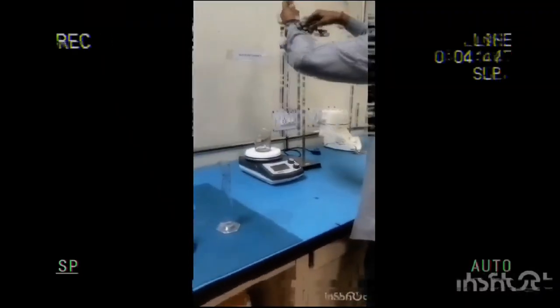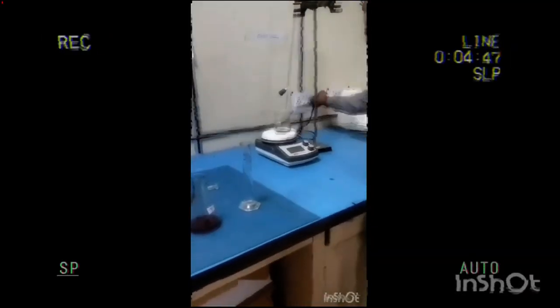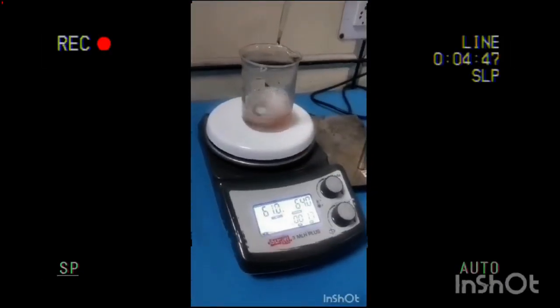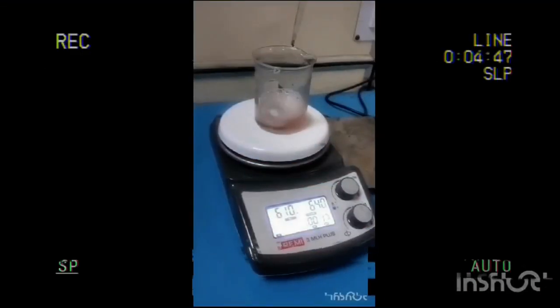20 ml extract is taken to check pH. It is maintained at 5 by adding acetic acid or NaOH. 10 ml extract of maintained pH is taken in a beaker and a magnetic stirrer is put in it. The stirrer is set at 60 degrees Celsius and 650 RPM for 30 minutes.